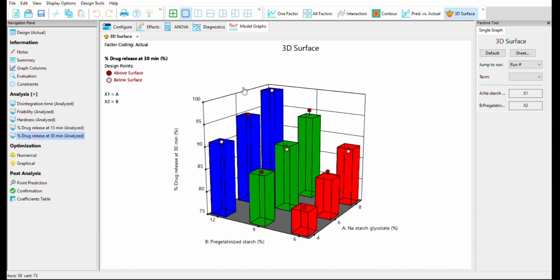So what are our predefined specifications? Predefined specifications are our dependent and independent variables. So we work with these predefined specifications, and actually quality is built into there. The quality of our ultimate tablet or immediate release formulation is built into this statistics, or built into this design. Okay, into this formulation.